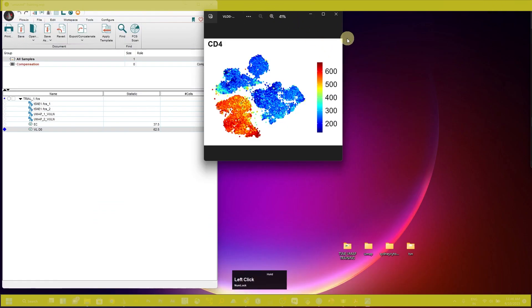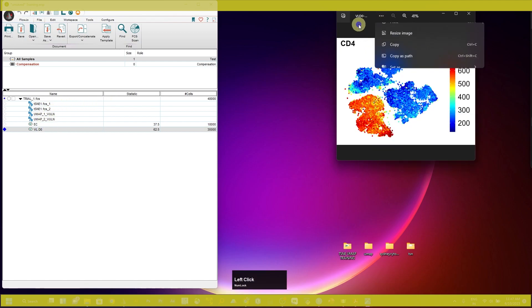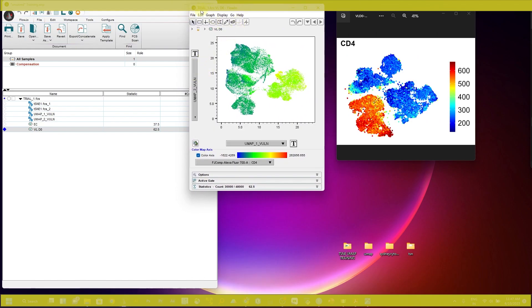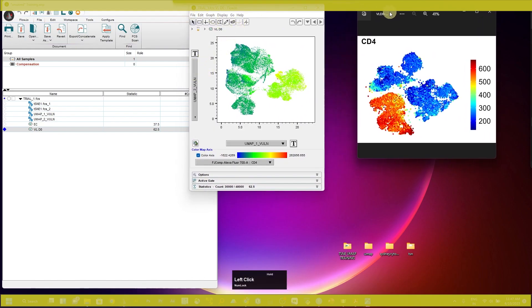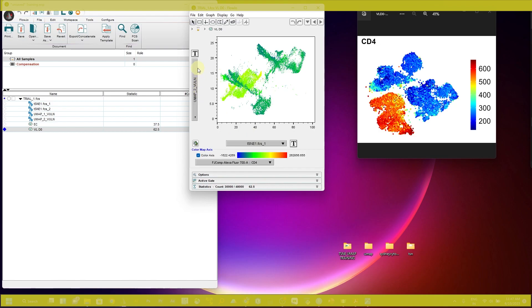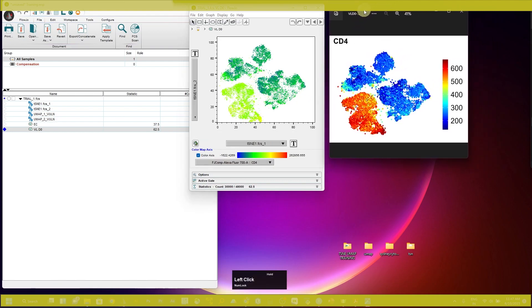If you open the CD4 t-SNE output, you can see the expression of CD4 on the t-SNE plot. Comparing it with the original t-SNE plot generated in FlowJo — changing the parameters to tSNE FCS1 and tSNE FCS2 — you can see the FlowJo-generated plot alongside the R-script-generated file. This R-script version looks much better than the FlowJo version.